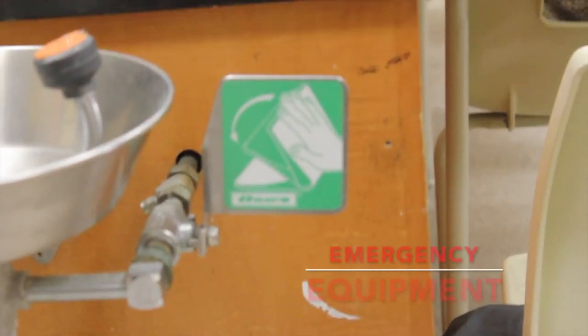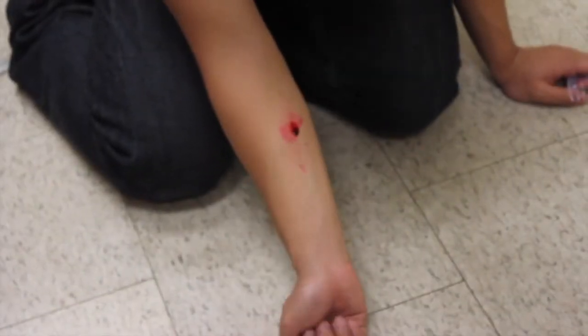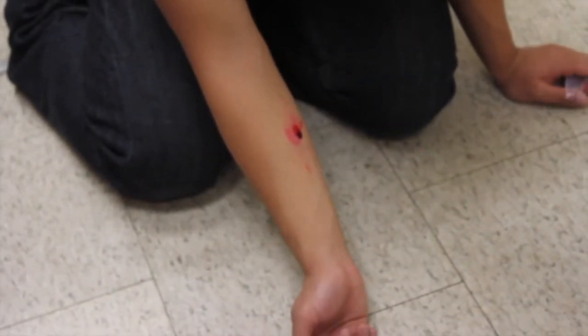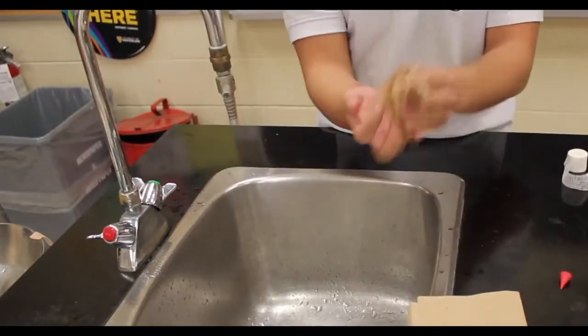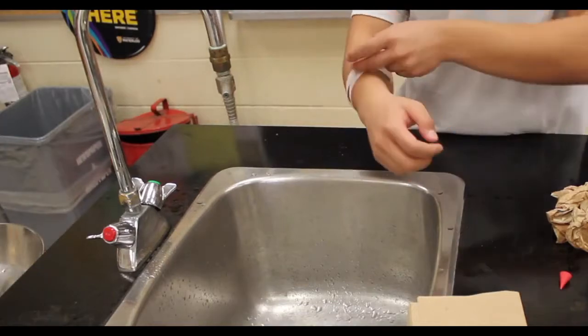Next is emergency equipment. Although precautions may be taken to ensure that no mishaps occur, accidents may still happen, and these are the best ways to deal with them. If you've cut yourself, wash out any traces of chemicals with water and make sure there are no pieces of glass in your skin. Then dry your skin to make sure that when the bandage is placed on, it will stick.